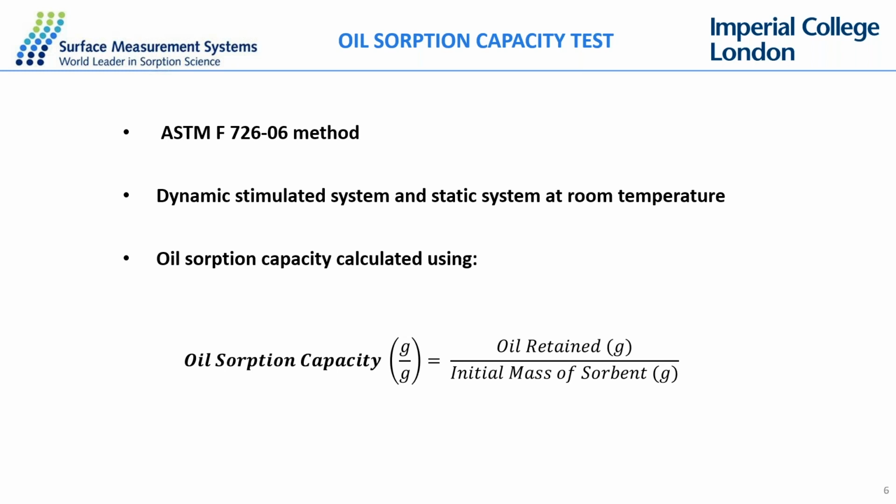So I'll just explain the static system. The only difference between the dynamic and static systems is that for the dynamic system, a shaker table was introduced to just get some form of vibration.